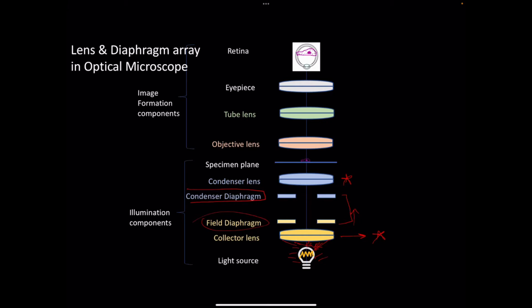Now the condenser lens has the job of illuminating our sample, in the case of trans-illumination. So this condenser lens is going to illuminate your sample with light in one way or another. How you want to do that is a difference, and that determines your illumination profile. The light which the condenser lens focuses onto the specimen is then partly transmitted by the specimen.